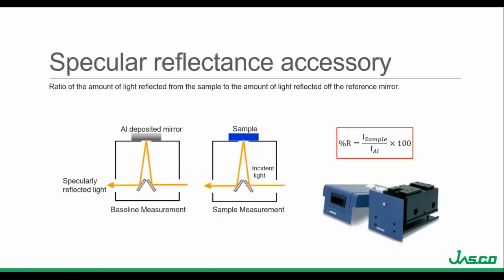To measure the relative specular reflectance of a shiny or mirror-like sample, an aluminum mirror is used as a reference standard. So all relative reflectance measurements, specular, diffuse, and total, assume that the standard surface being used has 100% reflectance. So it's therefore important that the reference plates are kept clean and in good condition, so their reflectance characteristics remain constant and don't lead to incorrect reflectance values.